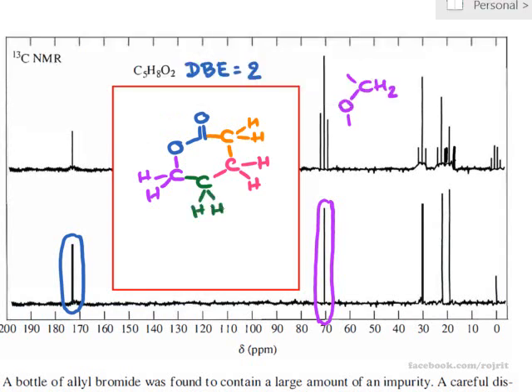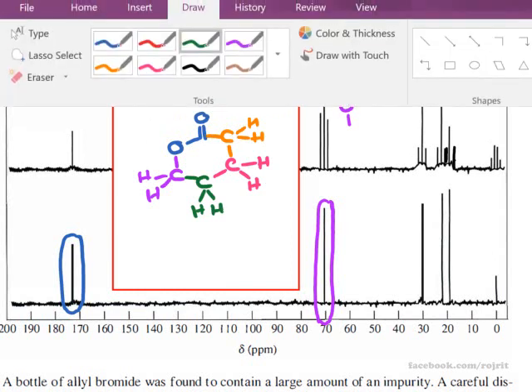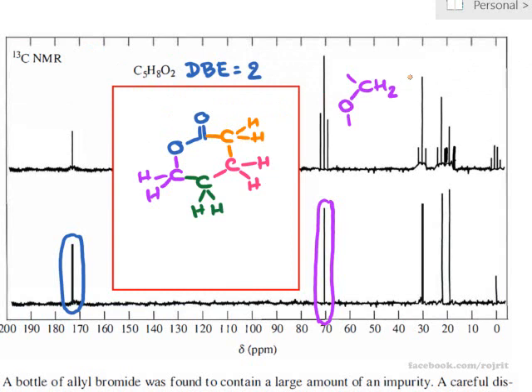But where are they, right? First of all, if you look at the 30, the 30 over here is CH2, no? But normally for 30, if you divide it by 15 or 20, it ends up about 2 ppm for hydrogen NMR. So this should be CH2 connected with the carbonyl, right? So the yellow color has to be this signal, right?